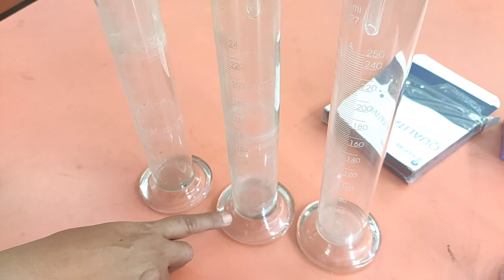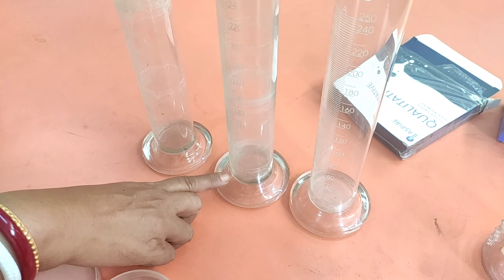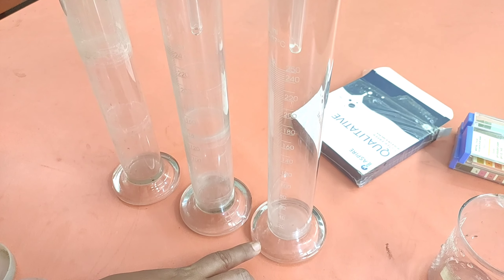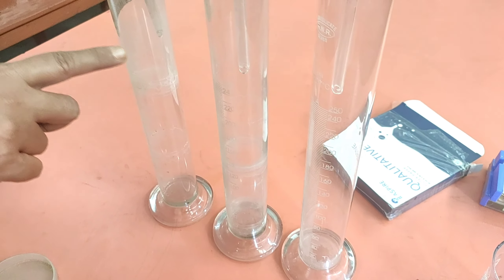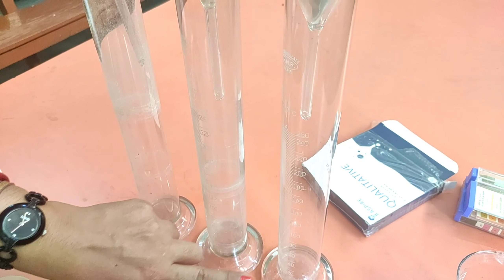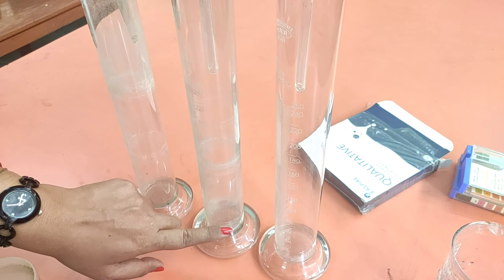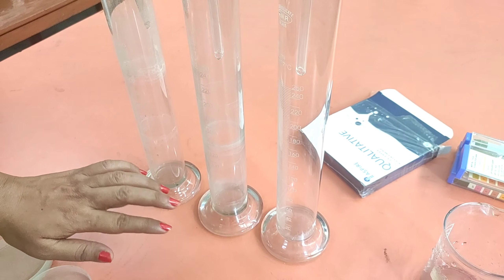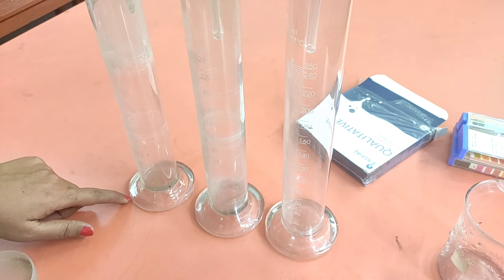Drop by drop from all three samples water is getting collected at the bottom of the container. This is sample A, sample B, and sample C. You can see already so much water has been collected in sample A, moderate water is getting collected in sample B, and in sample C the rate of water coming is very low — you can just see the drops. We will wait five minutes and then measure how much water is collected to understand the maximum water holding capacity of each soil.